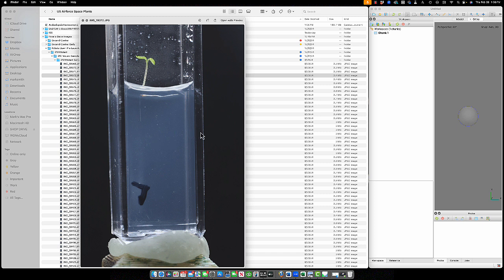We're also dealing with a cubic container, which means that we're only seeing a projection of the sample inside, because we're looking through a clear plane that is in only one image parallel to the lens. But in most cases it's oblique. It's at an angle, which means that there's going to be an optical shift. So 3D modeling this is going to be quite challenging for that reason.